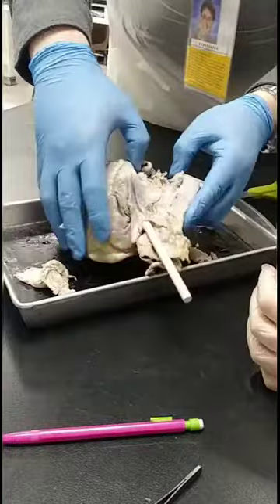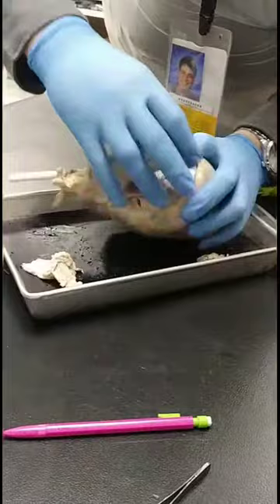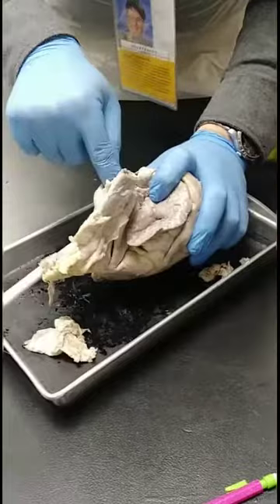This is your anterior side, so your posterior side is here. What we're looking for is kind of buried in there. You see how thin it is? This is one of the vena cava. Well, cava is the plural. So this is the vena cava going into the pig heart.